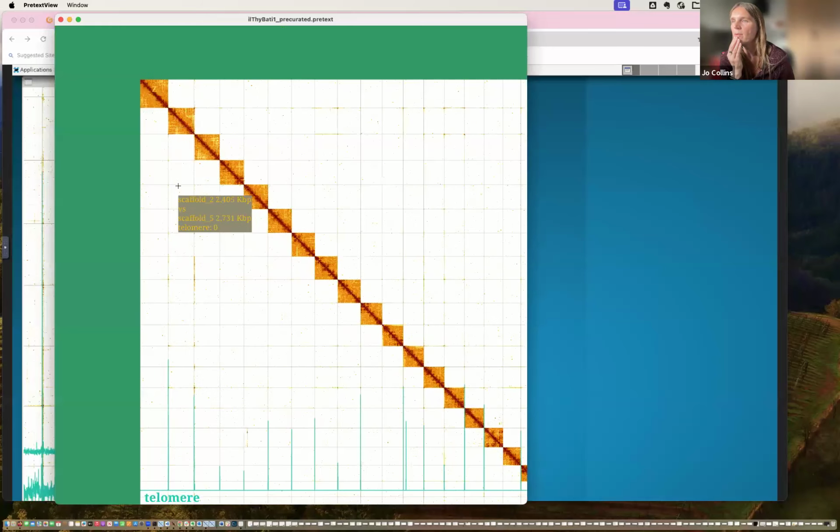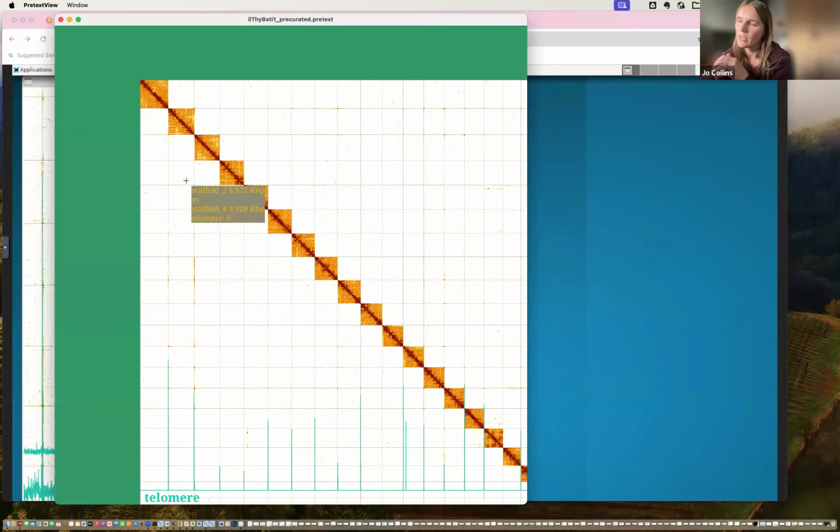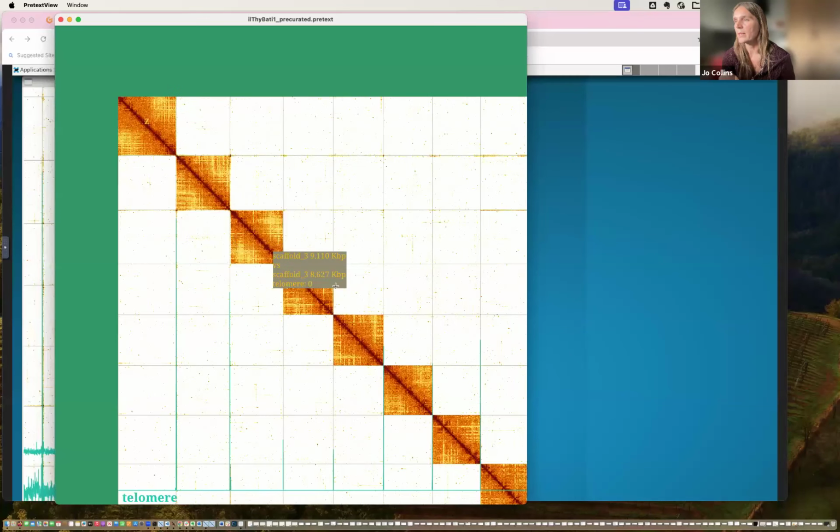Okay, so in this instance, we've used the Circos synteny plot. We've labelled our sex chromosome because we're comfortable that the evidence that we have for that is sound. And the other thing that we would do with Lepidoptera, when we do our submissions now, is make a note of the species that we've aligned to in our tickets that we use in our submissions, so that should somebody need to come back to that, there's a reference as to why we've named our sex chromosome.